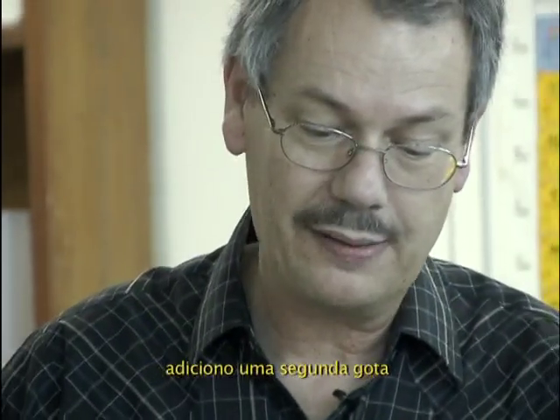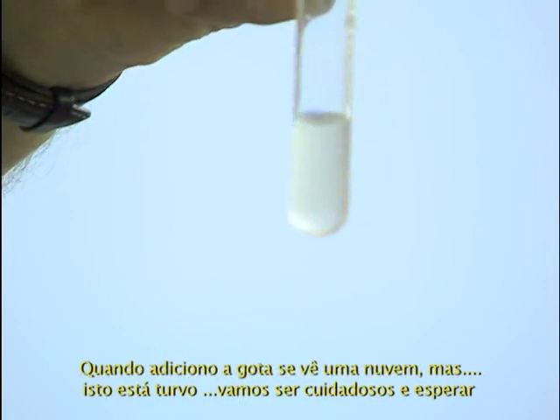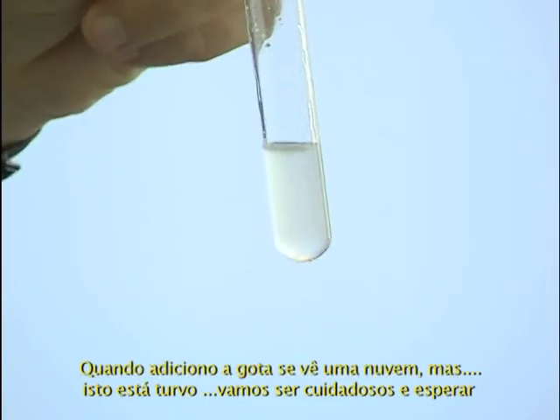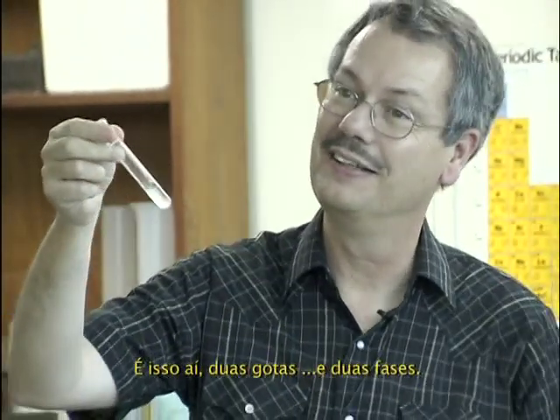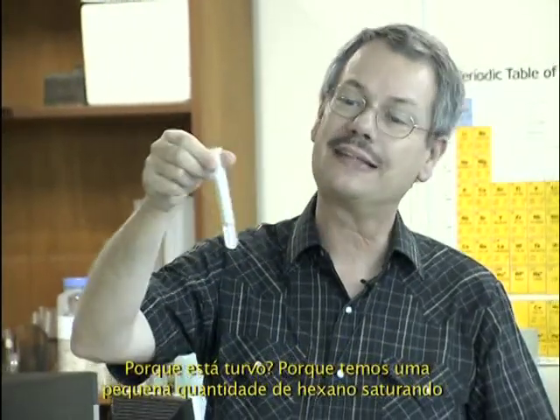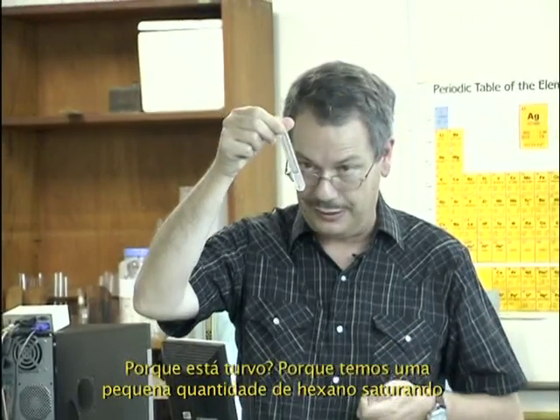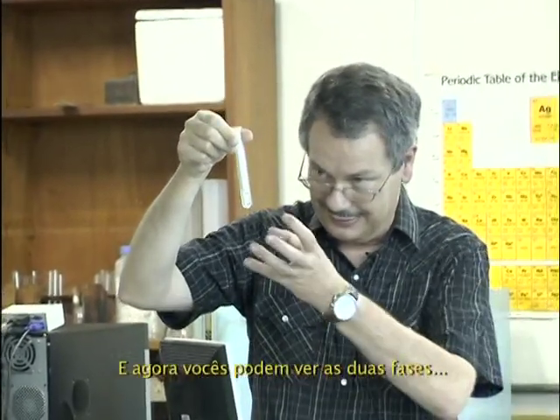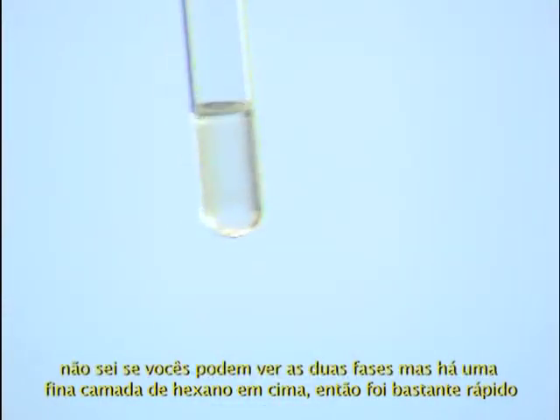Put a second drop. When I put the drop, you see some cloud. This is cloudy. So let's be careful and wait. I think that's it. Two drops, I get two phases. So why is it cloudy? Because there is a very small amount of hexane that saturates itself in, and now you can see the two layers. I don't know if you see them, but there is a thin layer of hexane at the top.